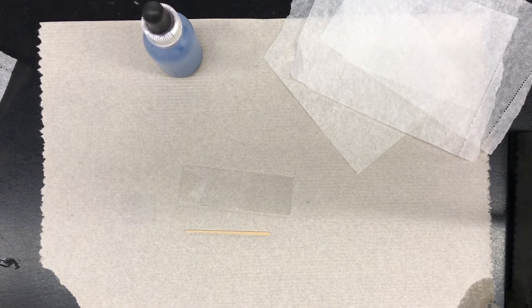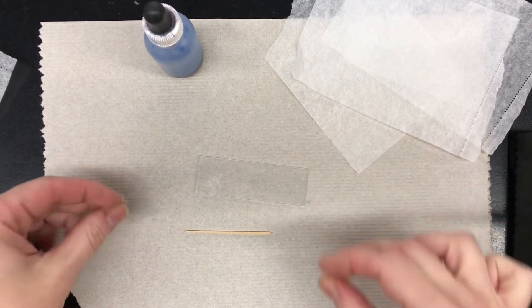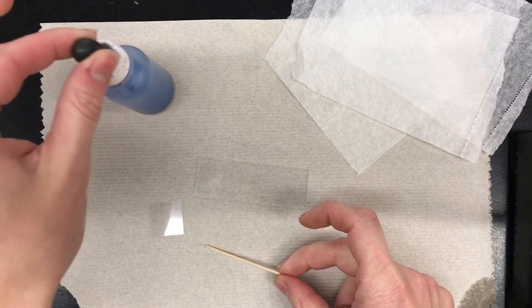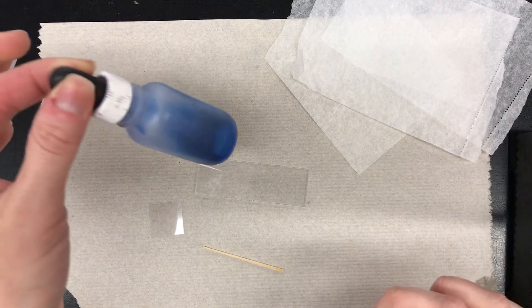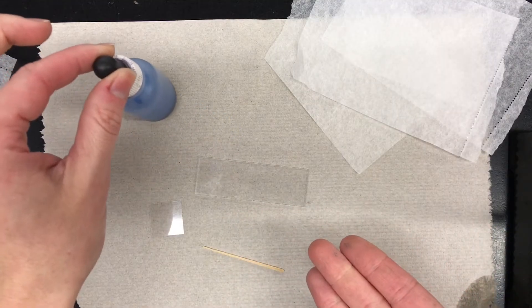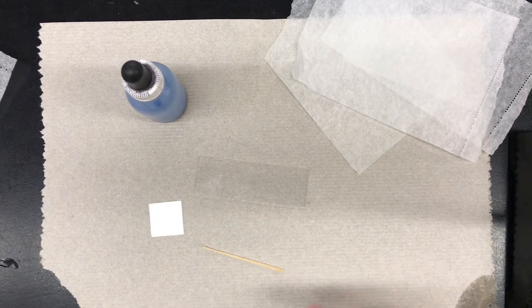In order to make a wet mount slide with our cheek cells, you're going to need a glass slide, a cover slip, a toothpick, and some methylene blue. The methylene blue is our stain and it does exactly that — it stains things. If you get it onto your clothing you will have a blue stain, and if you get it onto your hands you will have a blue stain on your hands. Keep that in mind.